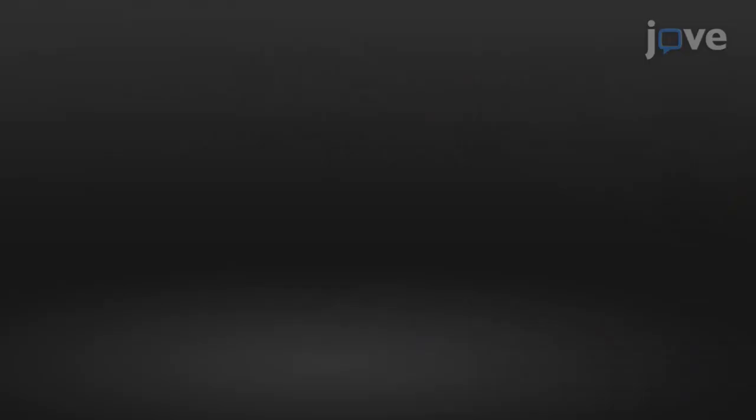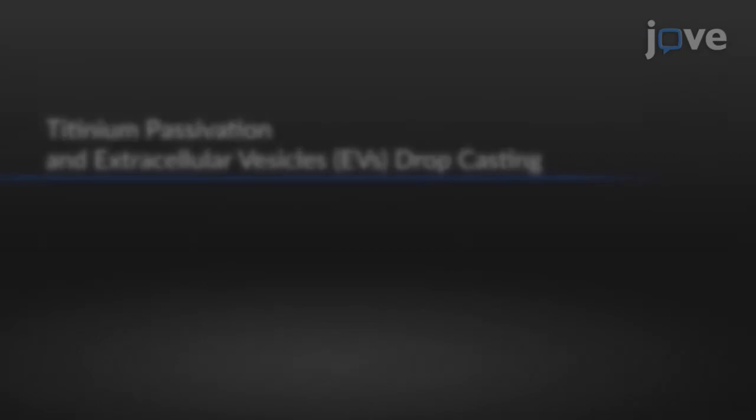Incubate the titanium implants in a 30% nitric acid solution for 30 minutes at room temperature with gentle agitation. After incubation, perform at least five washes with deionized water.